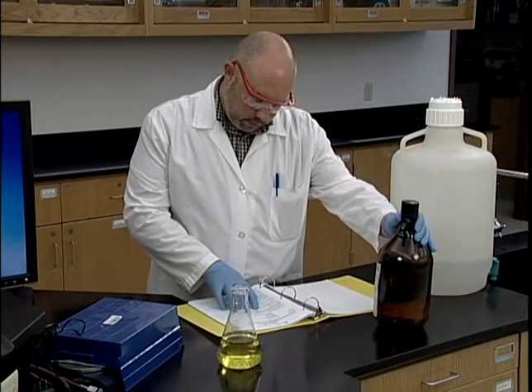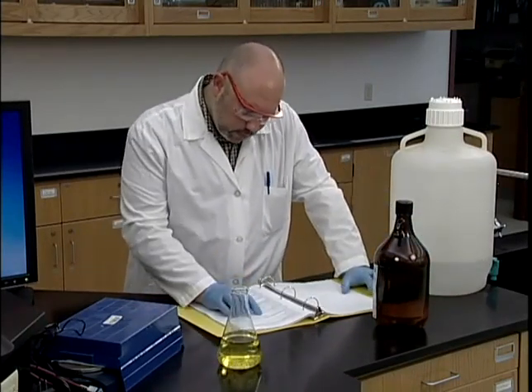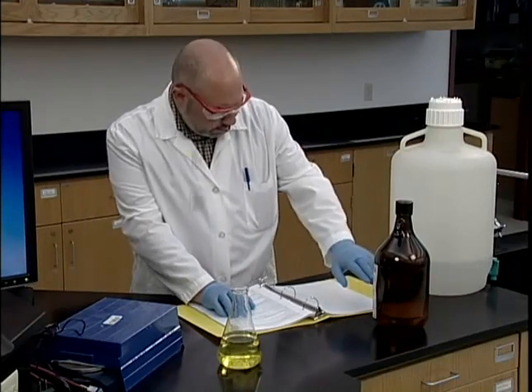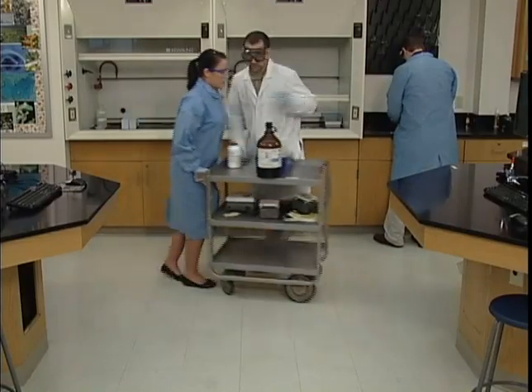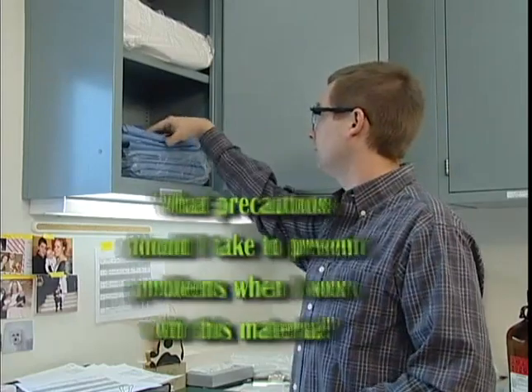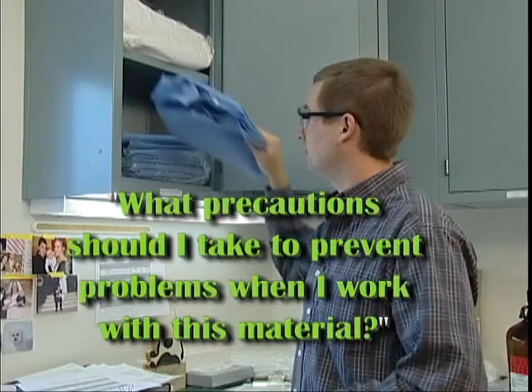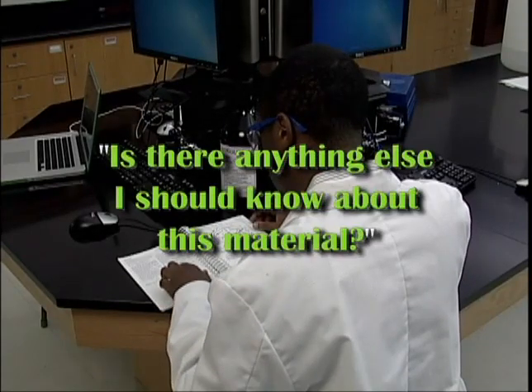Safety data sheets are designed to answer 4 basic questions that anyone who encounters a chemical might have. What is the material and what are its hazards? What should I do if a problem occurs when I'm working with this material? What precautions should I take to prevent problems when I work with this material? And finally, is there anything else I should know about this material?